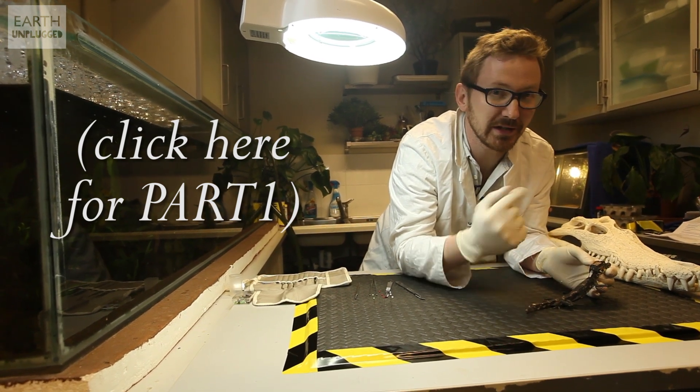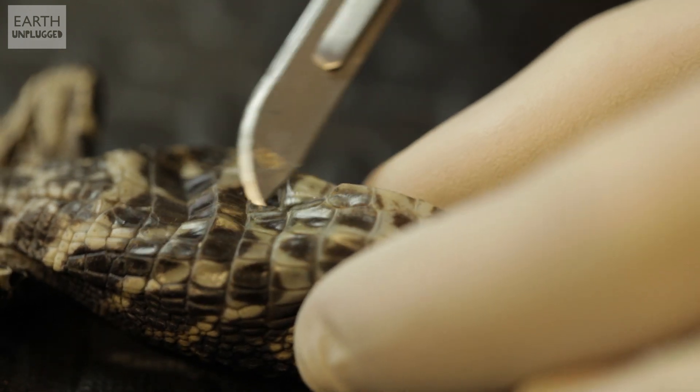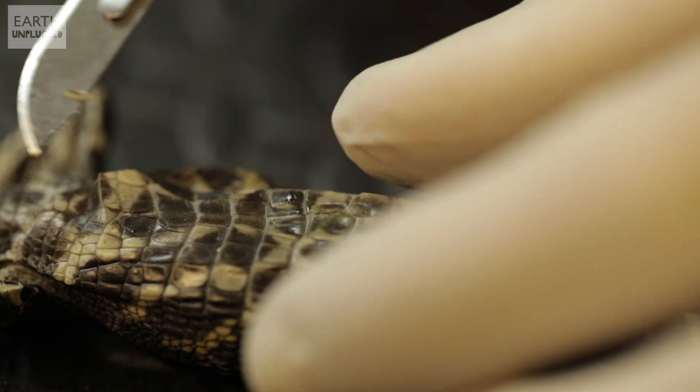I think it's time to open him up to see that he's a predator on the inside as well as on the out. Let's just get down the middle here, pop the bits inside.